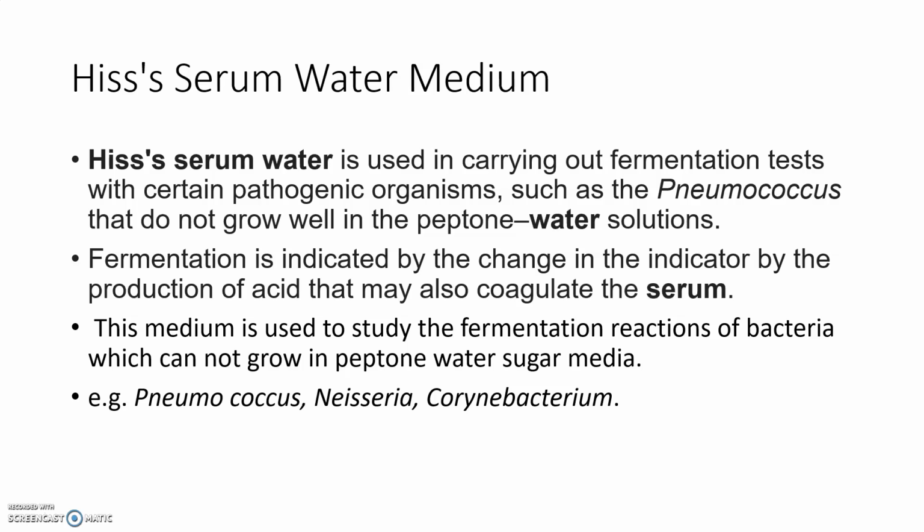And in this medium, the fermentation takes place and it is indicated by the change in the color of the indicator by the production of acid. And that may also coagulate the serum. That acid coagulates the serum.